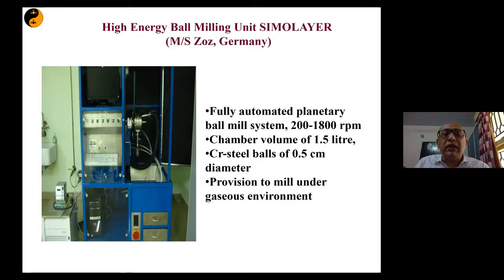So this is another component of the material synthesis facilities. This is a high energy ball mill, which again has all these things. This is for large volume. Usually, basic research goes for very small volume. However, this has large volume.